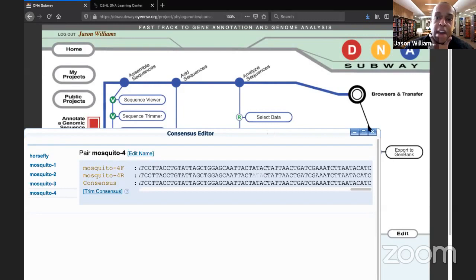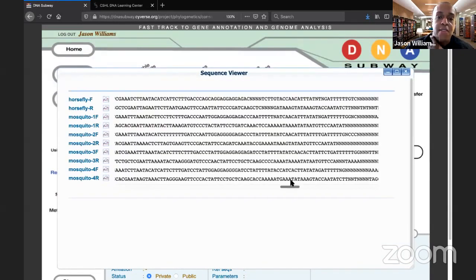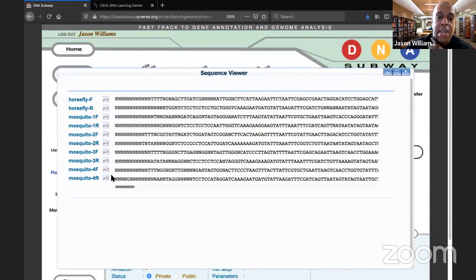There's another question in the chat, which is why, when we look at the Sanger sequencing, do we get so many Ns at the beginning and at the end? So I'll say it one more time. The beginning is easier to explain. At the very beginning of the sequence, the fragments with the fluorescent markers are 5 bases long or 10 bases long or 20 bases long.